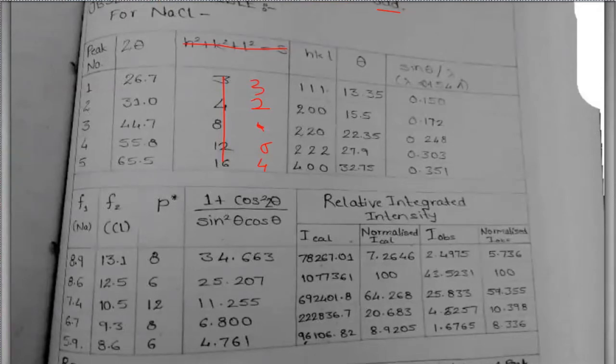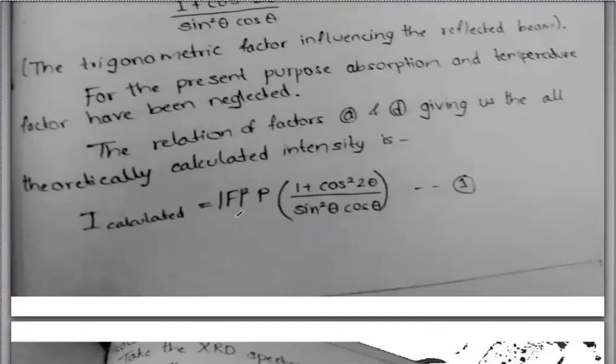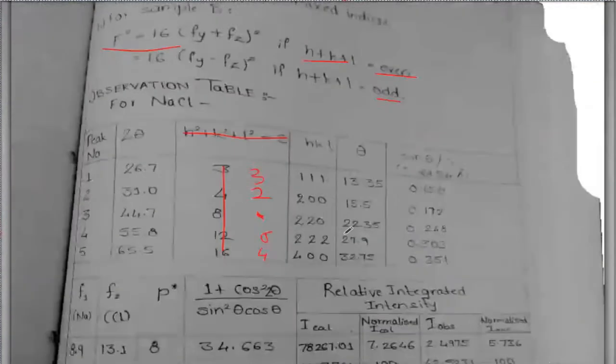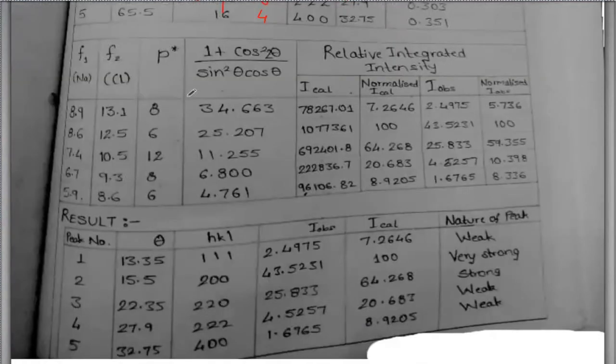Okay, as per the formula that we saw here, mod of f square. Now you have got the p value. Okay, p value depends simply on the HKL parameter, but this is multiplicity, then atomic scattering factor, then HKL dependent factor, and this value. So once you calculate these three values, then you will get the final intensity like this.